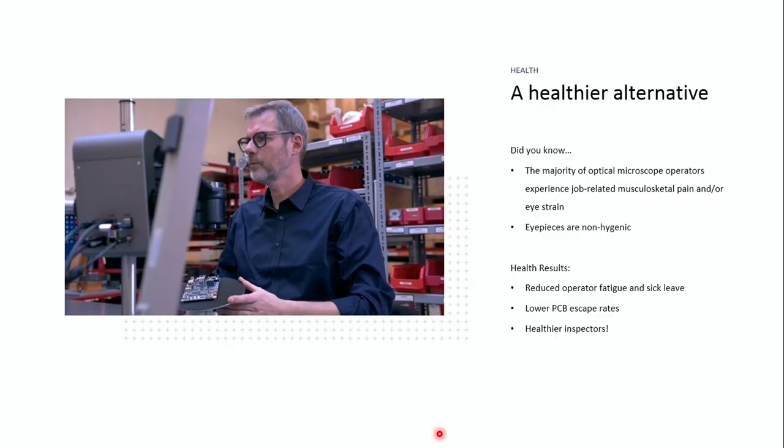The other item that's come to light most recently with COVID is that eyepieces are actually quite unhygienic. So if you have a bunch of people all putting their eyes on an eyepiece, it's not an ideal situation in this COVID era. Obviously, we have some benefits related to these things, and it just all adds up in making the digital decision a lot easier.